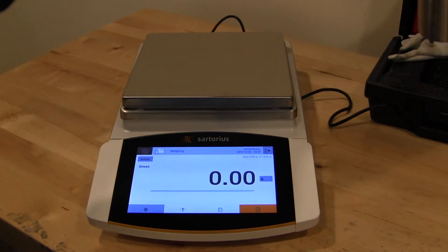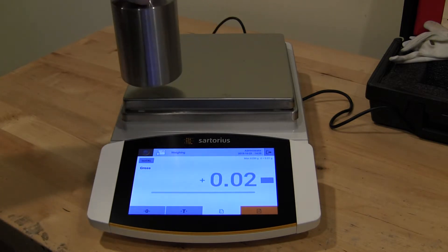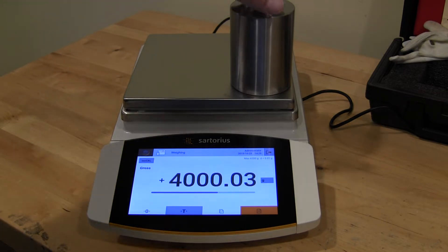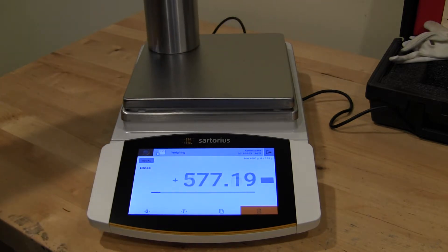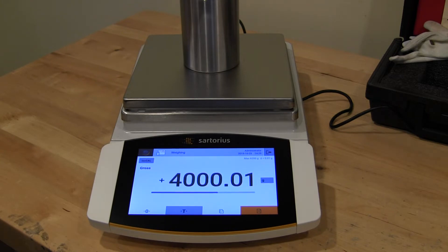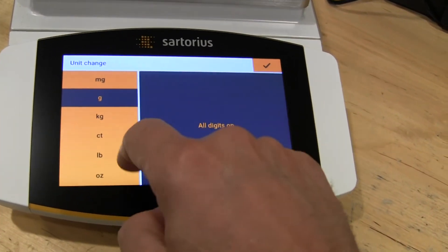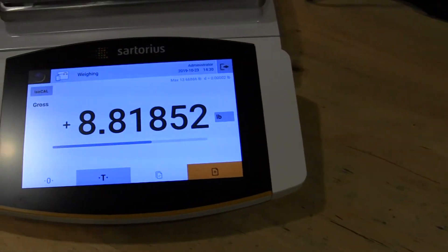So the four kilogram weight — and the eccentric loading. Now to change the weigh units I can just tap on grams and you'll see I can pick whatever I want. If I want pounds, select pounds, check the box, and now we've just changed the weigh unit.